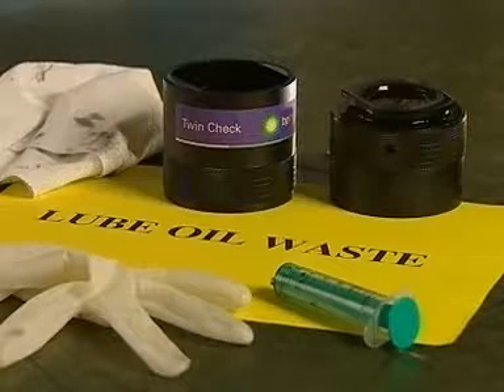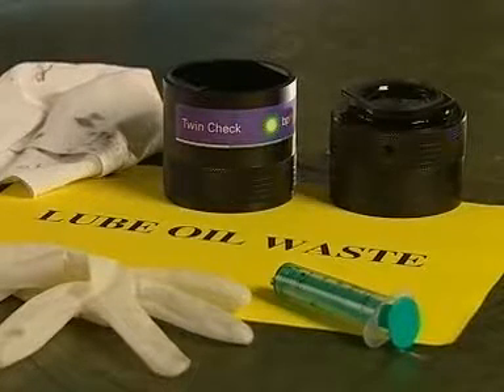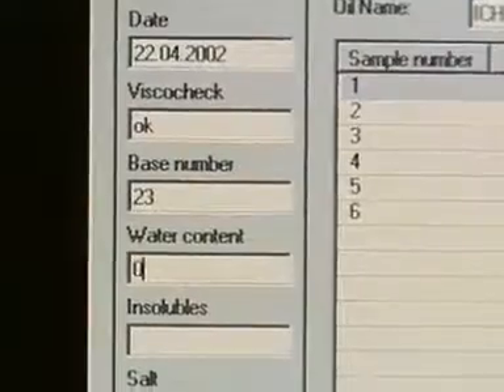Clean all equipment and dispose of oil properly into your waste oil tank. Record all test results on the ship's data system.